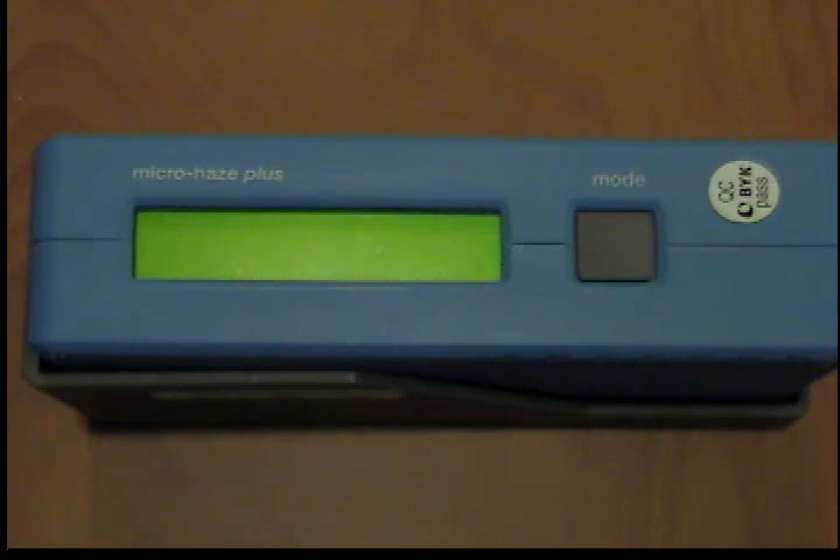Acetone may be used in case of severe contamination. Apply as much liquid as possible to the standard and remove it with the help of a new lint-free cloth. Exact calibration is only possible with perfect standards. If the condition of the standard should appear doubtful to you on the basis of a visual inspection or a measurement error, we will be glad to check the standards.